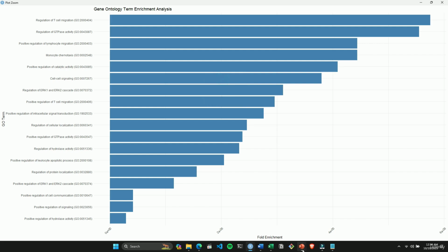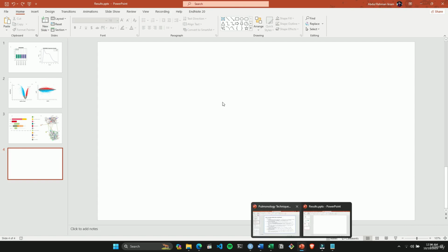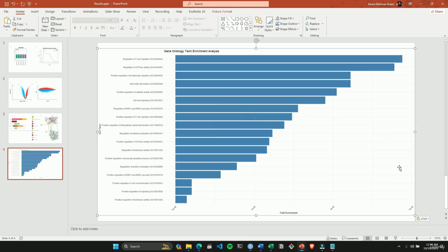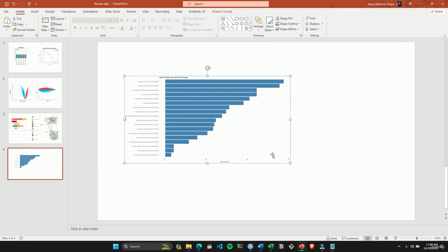So once we have this, we will copy this image and move to our results tab and paste it here. Sorry for that. If we can, yes, we will paste them here.